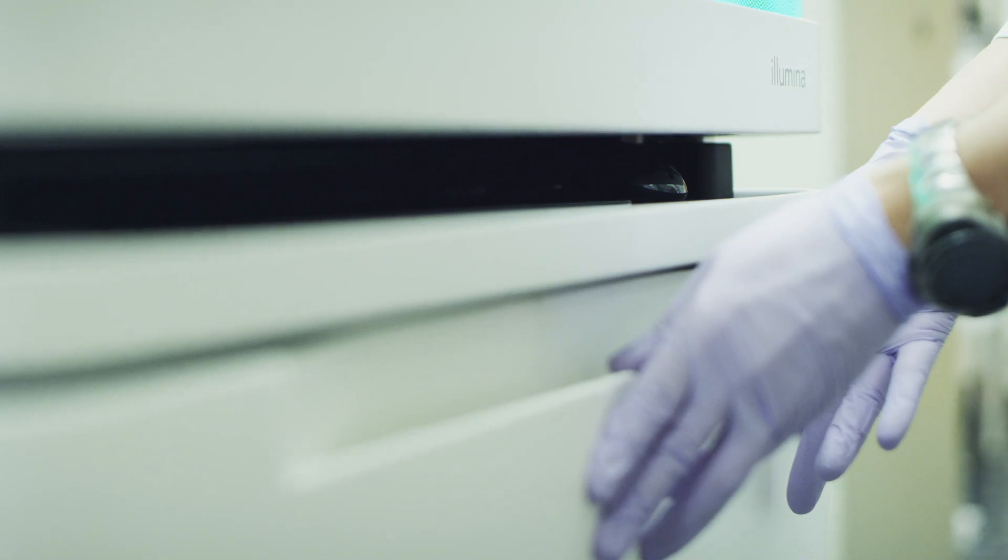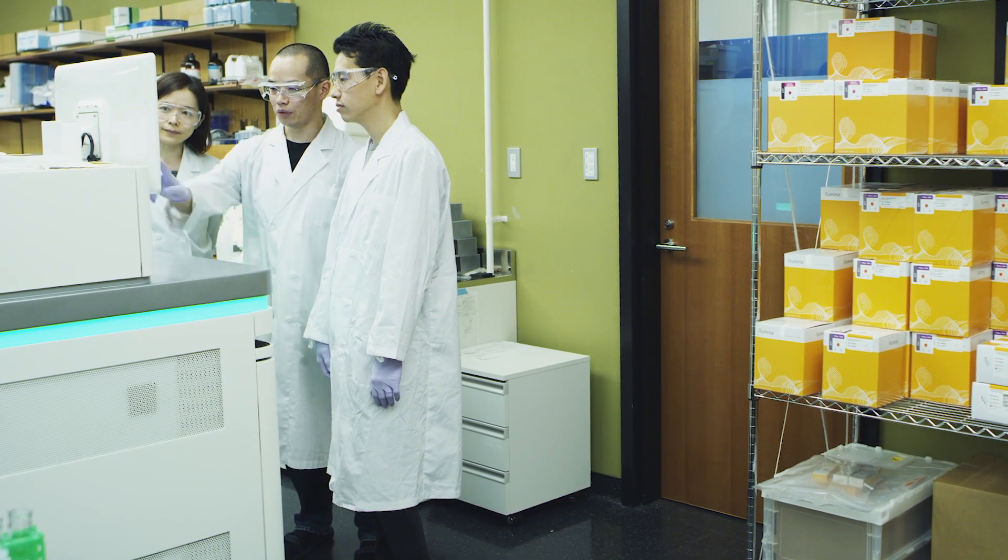NovaSeq will transform our research work because of high throughput. We can analyze more data. Though we have sequenced a number of species, there are a lot to be sequenced.